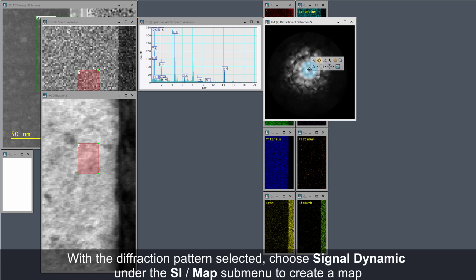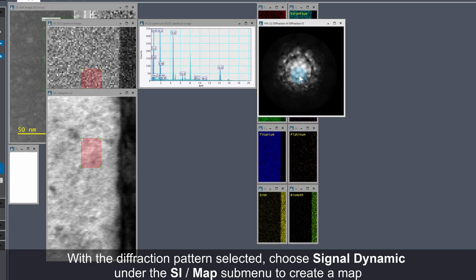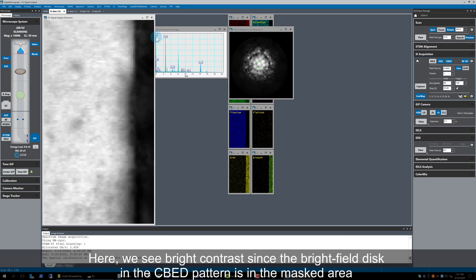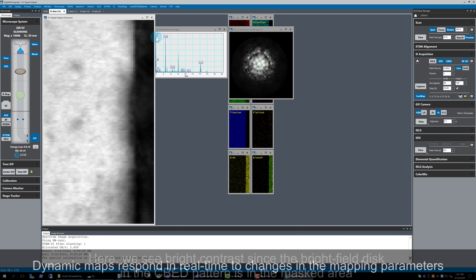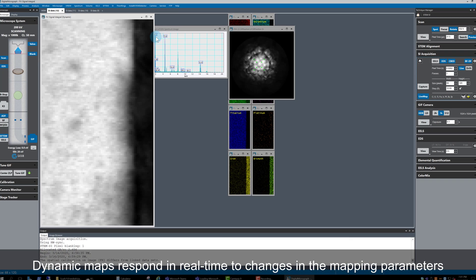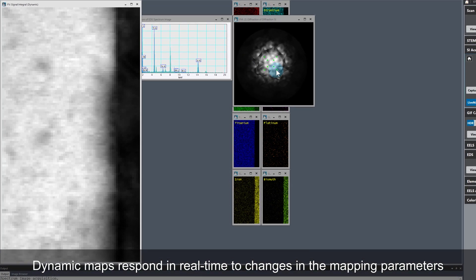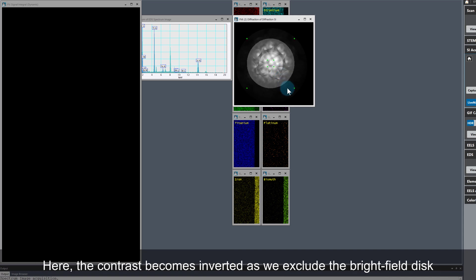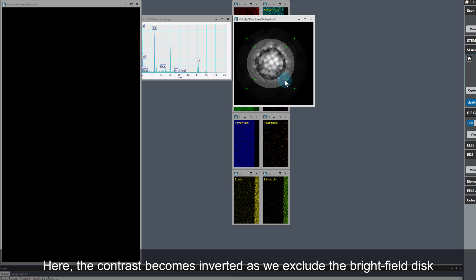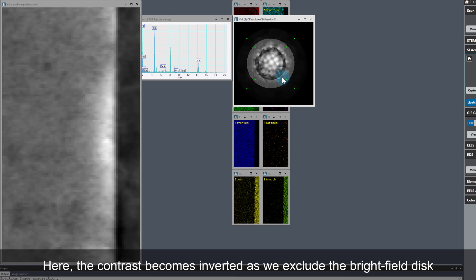With the diffraction pattern still selected, go to the map submenu in the SI menu and choose signal dynamic to create a map. The STO region currently shows bright contrast as the bright field disk in the CBED pattern is in the masked area. Dynamic maps respond dynamically to changes in the mapping parameters. As soon as any changes are made to the inner and outer angles of the mask, the map is recalculated. Look at how the contrast becomes inverted as I exclude the bright field disk by increasing the inner angle of the annular mask.